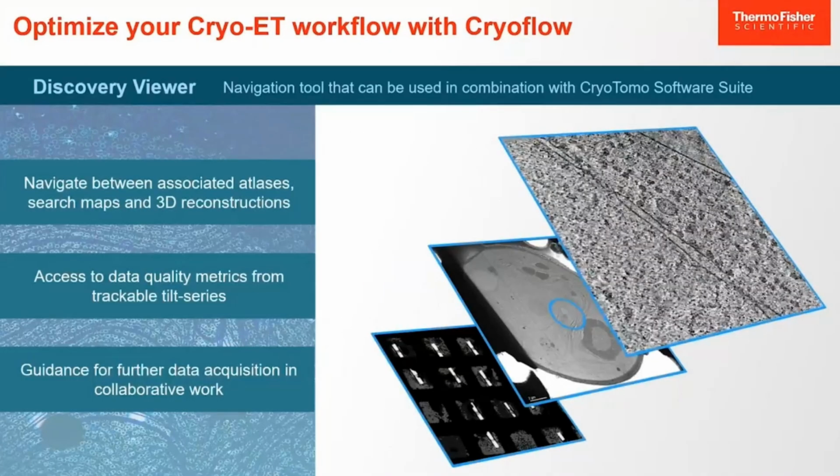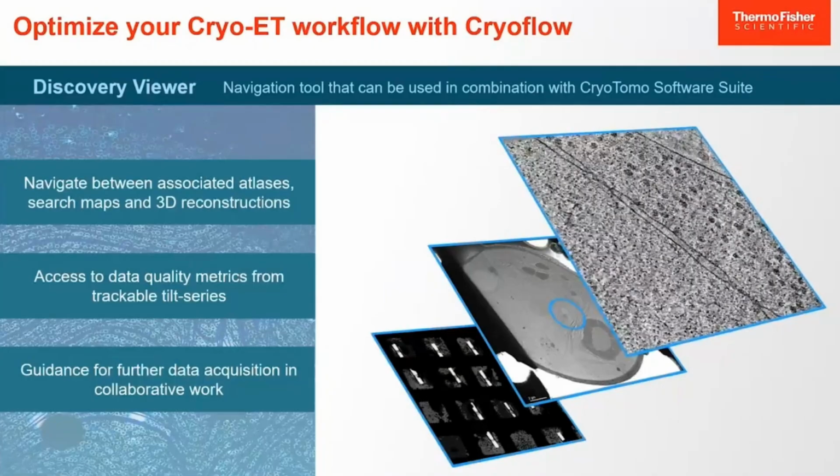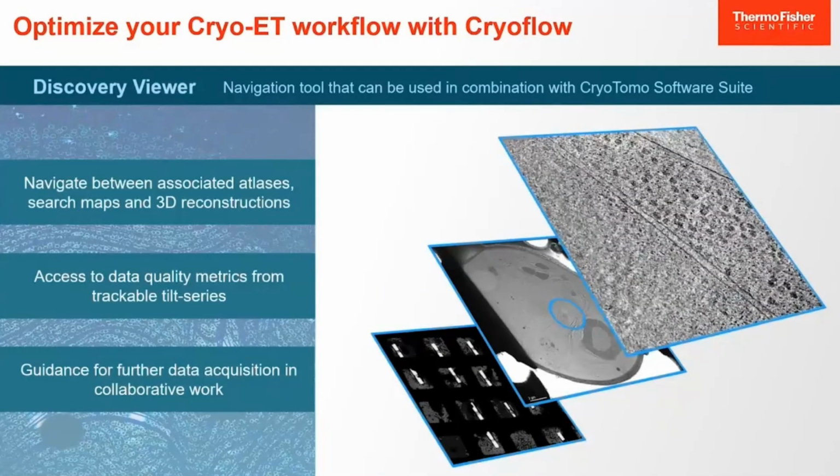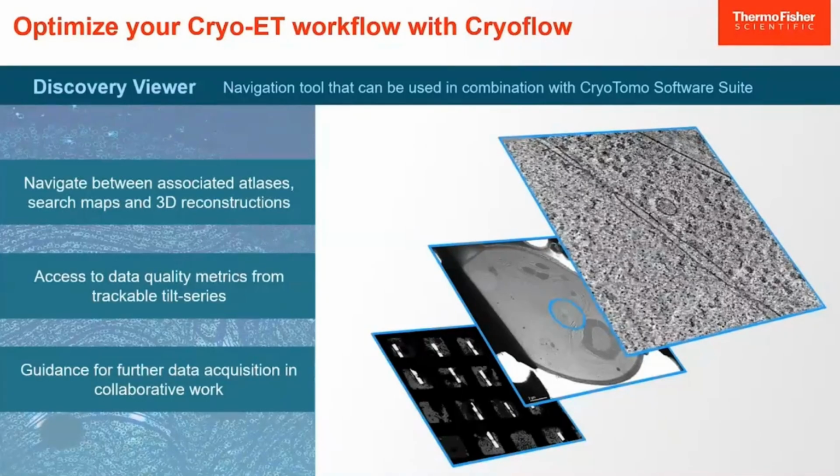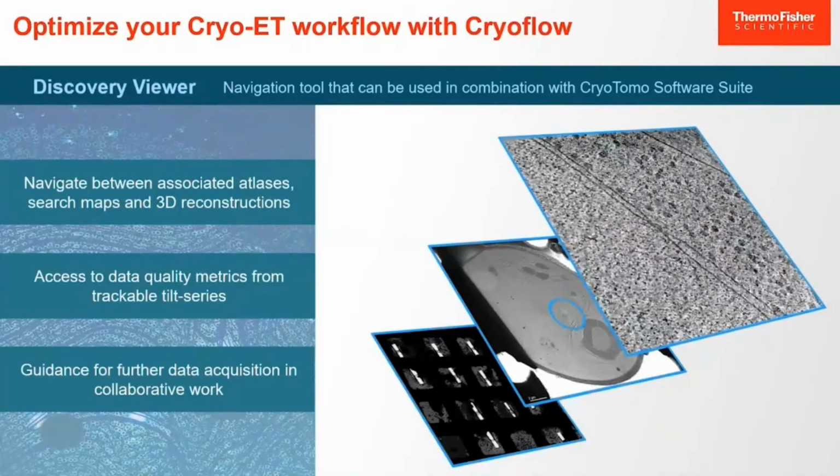Now, the last new thing that I would like to mention here in the tomography software is the discovery viewer that we're implementing, which basically brings all the works together. It runs in CryoFlow, and it allows you to look at all the atlases that you've taken, at all the specific search maps that you've acquired, to zoom in to the specific batch position, the multi-shot position, and then also show the tomogram.